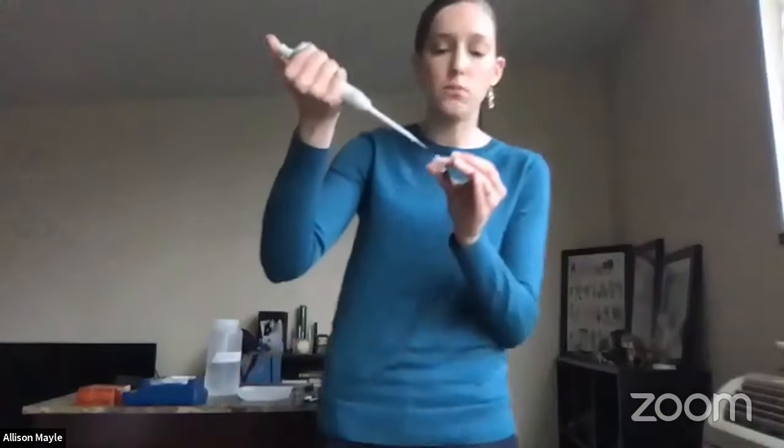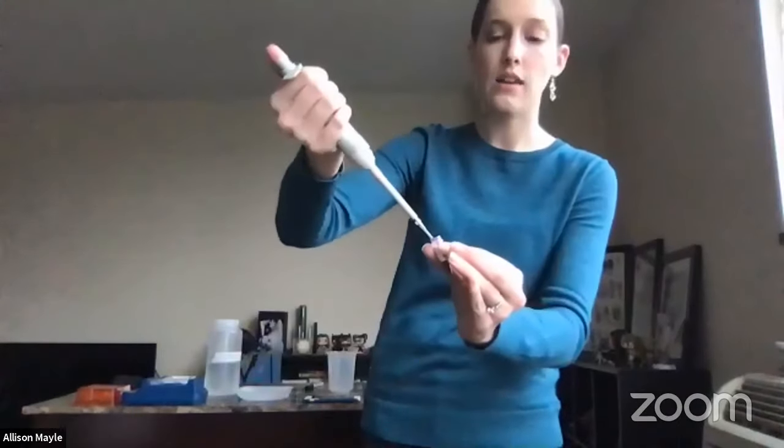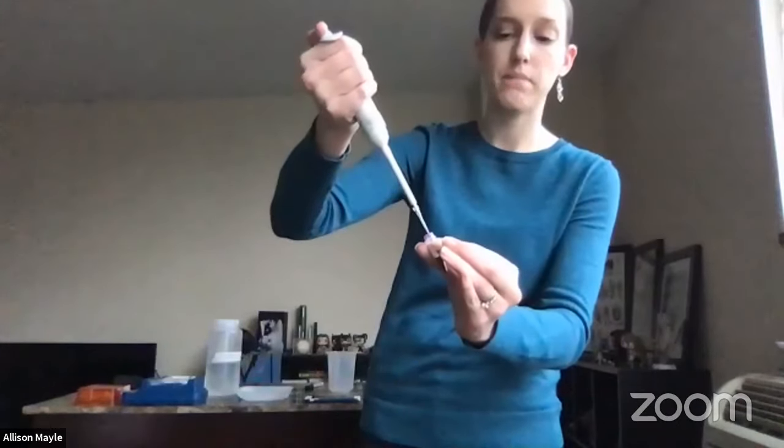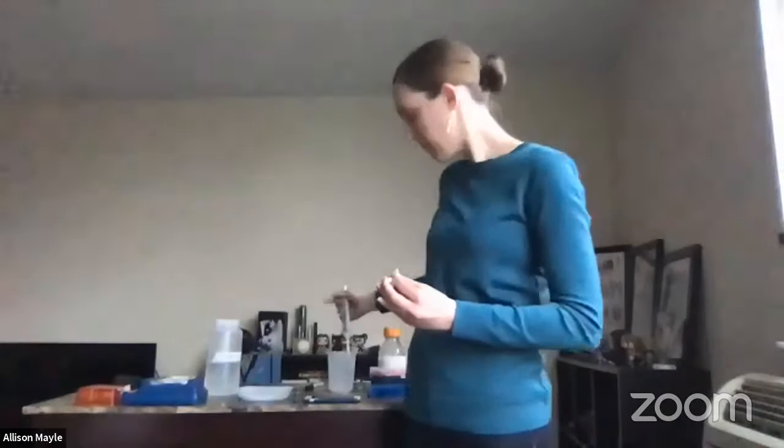All right, and then I'm gonna put it back into the same tube, but you would put this into your gel or into whatever tube you were transferring into. And you press all the way down to the second stop to get your DNA out of the pipette tip. And then you would throw that old pipette tip away and get a new pipette tip for every single sample that you were running on your gel or that you were setting up to do an analysis.